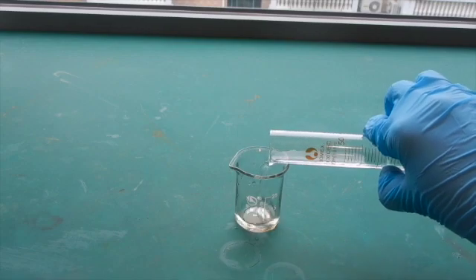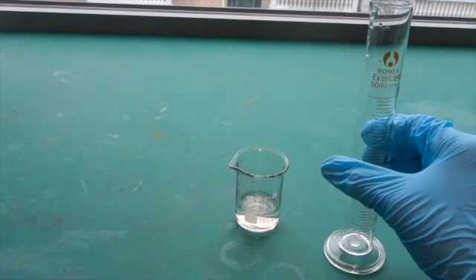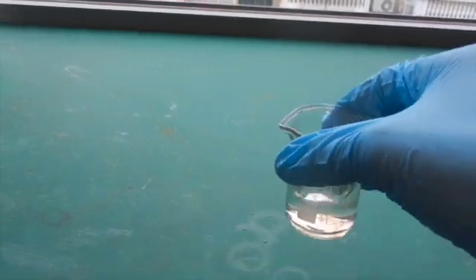First, pour about 15 milliliters of hydrochloric acid into a 25 milliliter beaker, and then pour 10 milliliters of hydrogen peroxide. Put the piece of platinum into the mixture and stir gently.